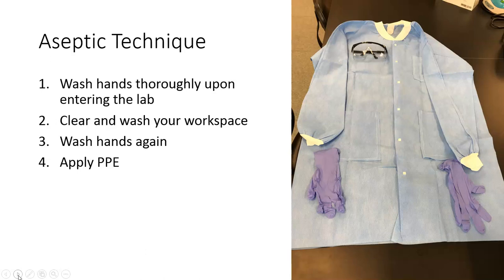After you've washed your desktop, you'll want to wash your hands again. You'll scrub them hard to get rid of any microbes that you might have acquired from the desk, and also to see if you can remove any last stragglers that you might have brought in from outside.